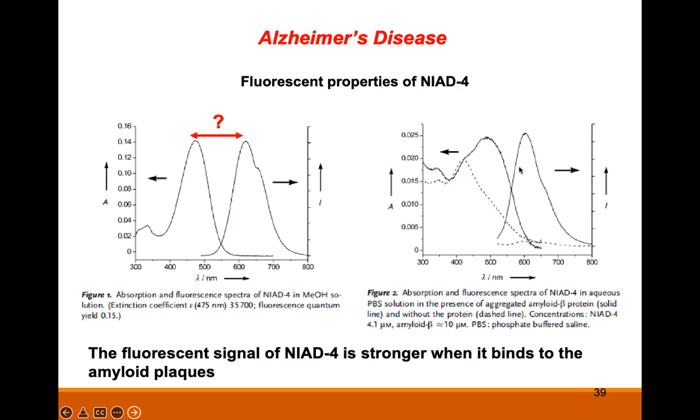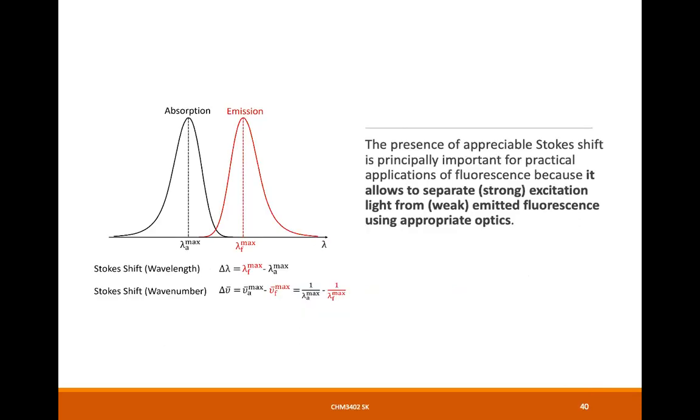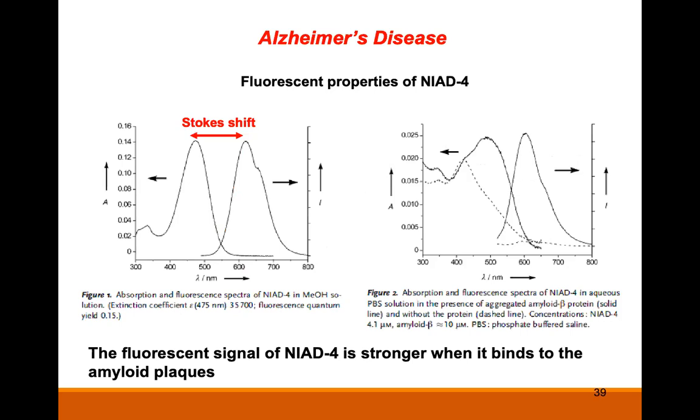So this is one of the many applications of fluorescence, but in fact, fluorescence is very interesting because it is more sensitive and more selective. So it's good for you to at least get to know fluorescence. If one day you wish to synthesize compounds, it's good to know this technique, right? And the last part for fluorescence is about Stokes shift.